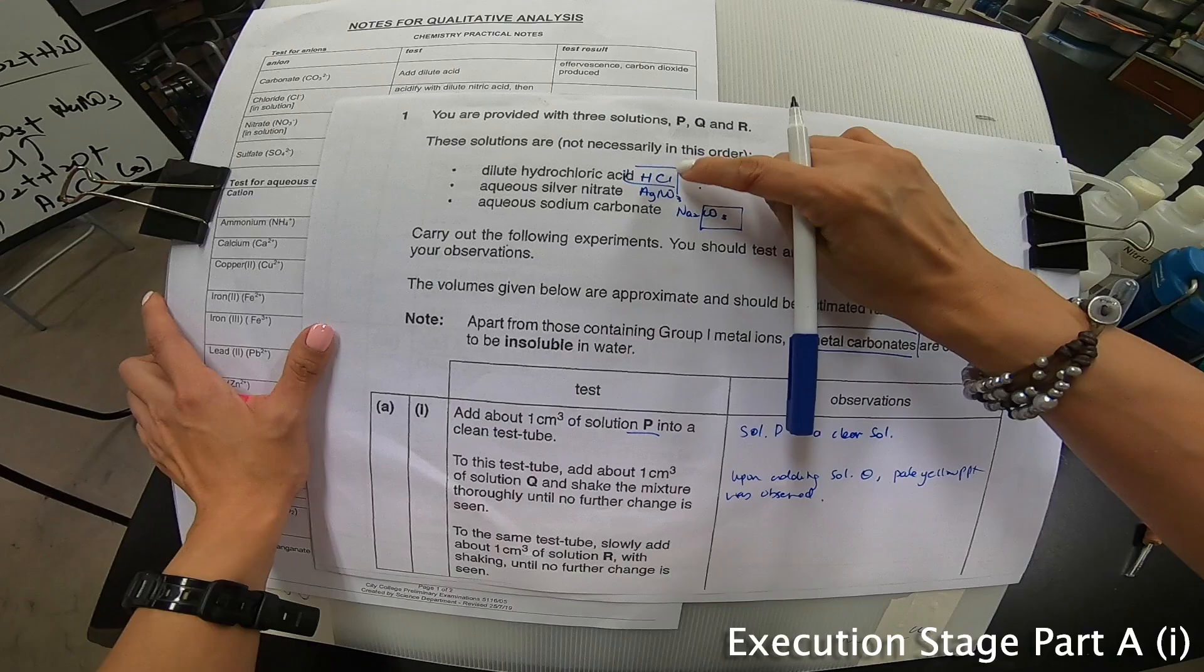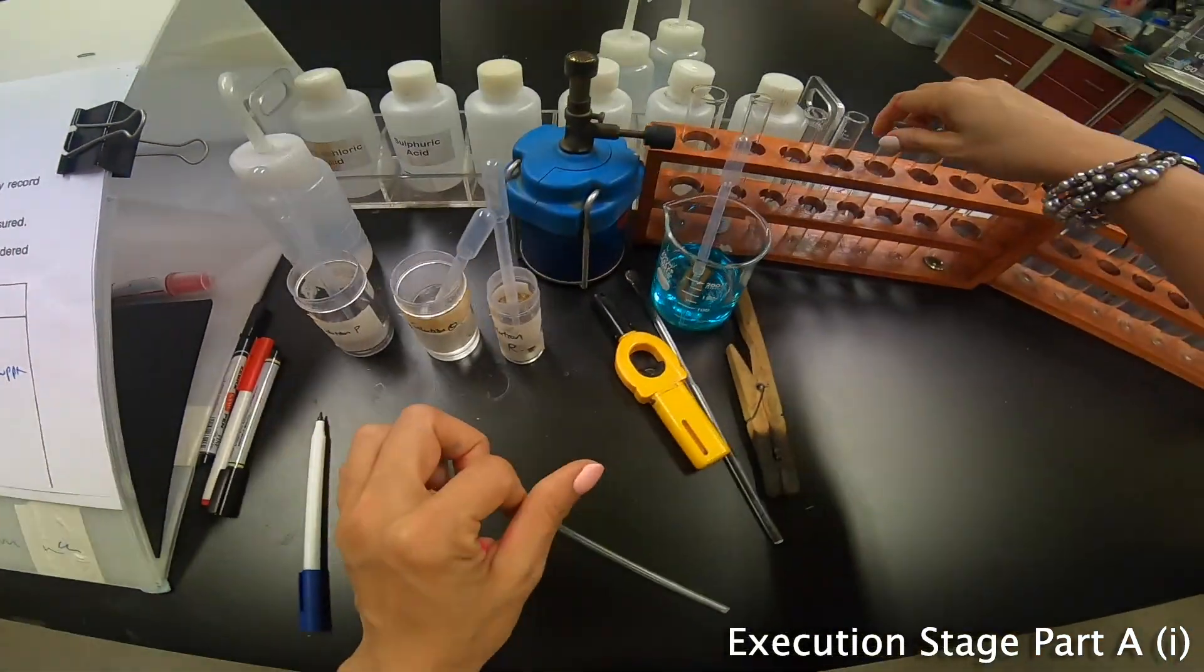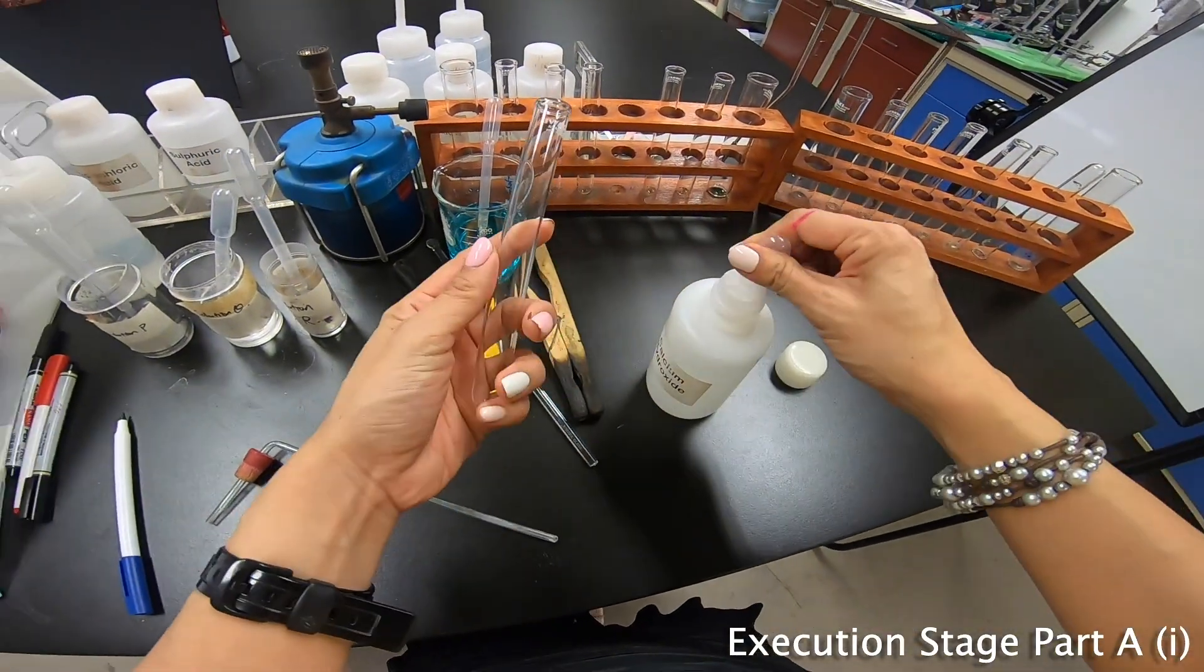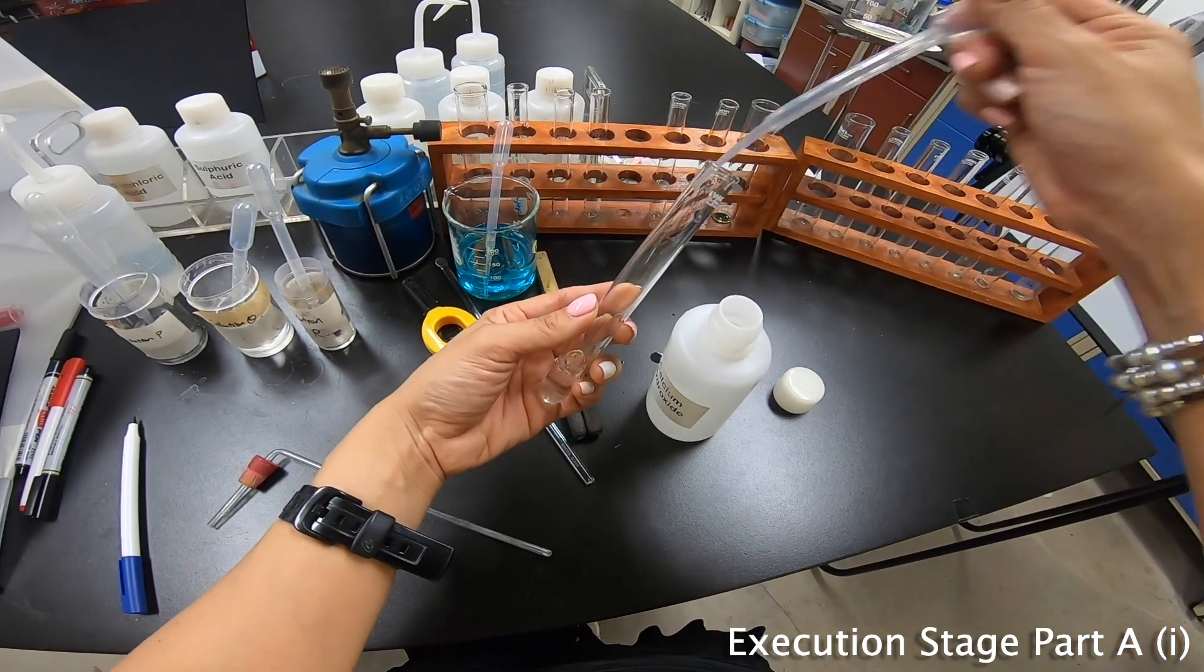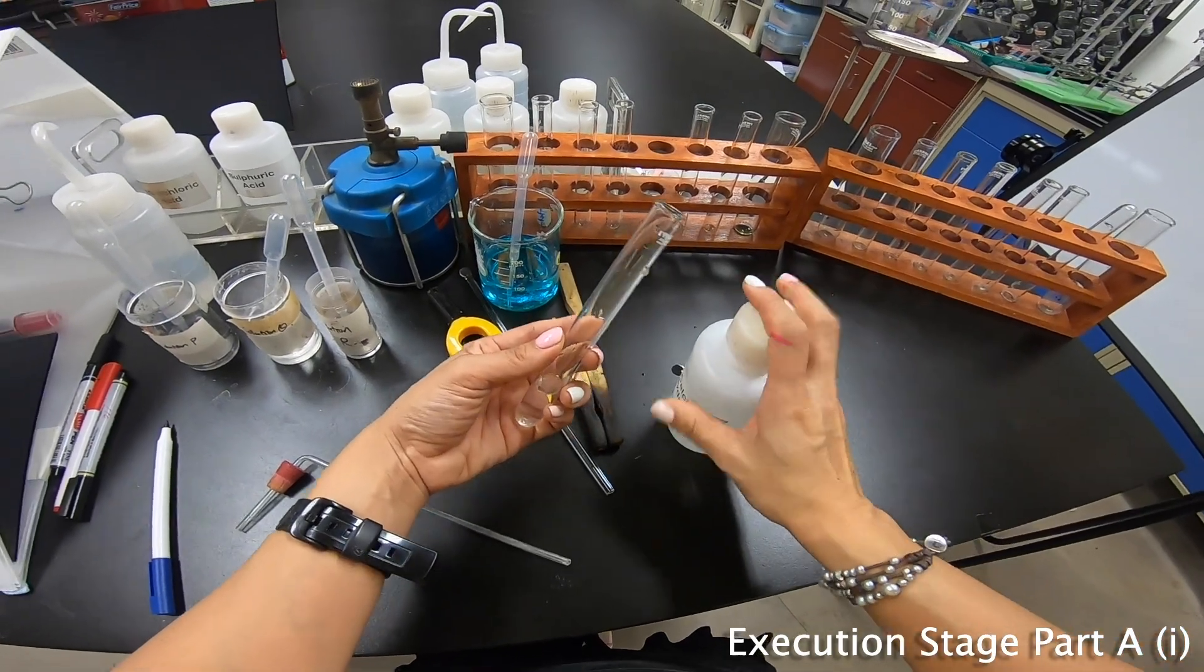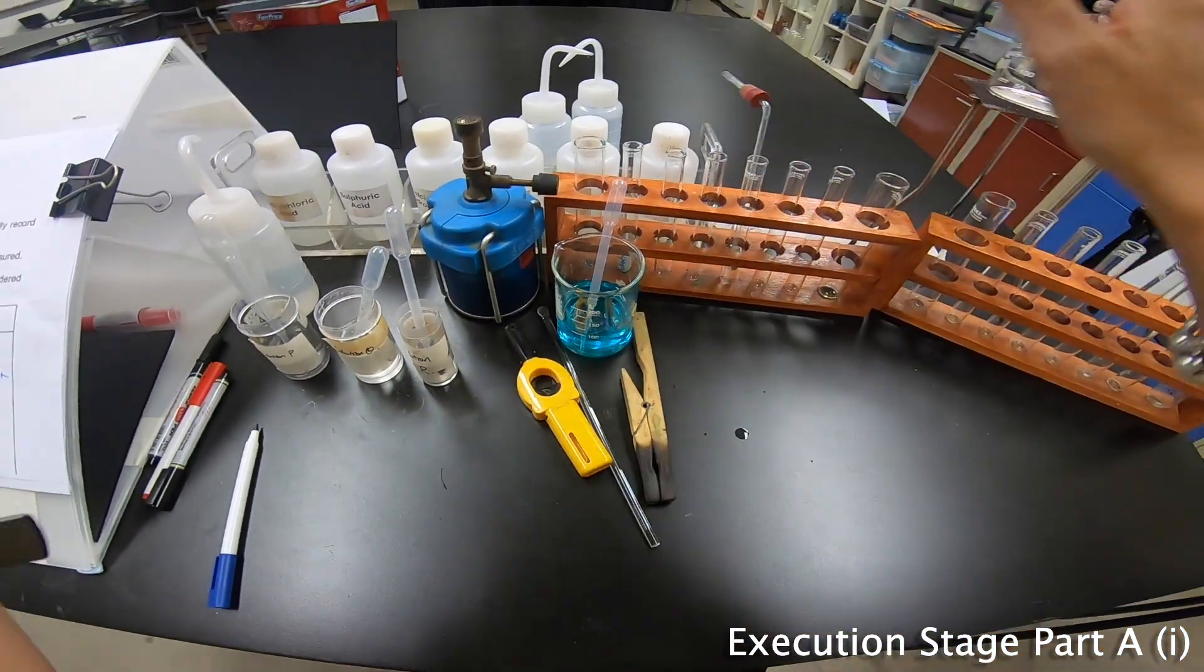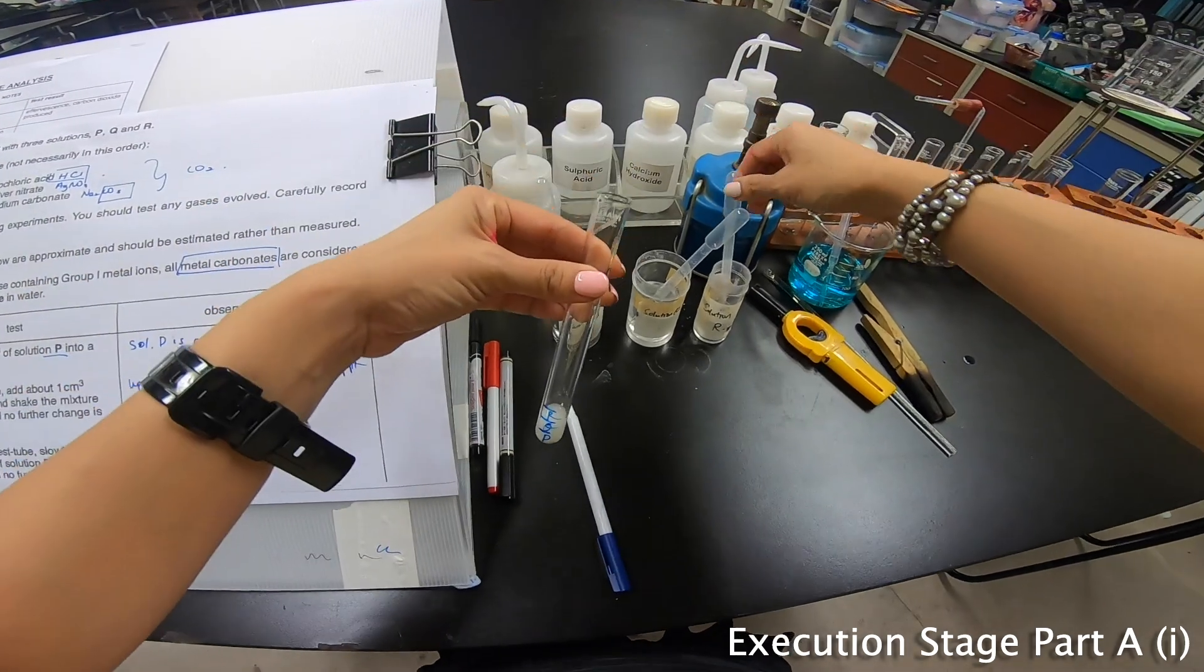Upon adding solution Q, a pale yellow PPT was observed. Now, before I add R, I want to pause for a while. Because I notice here that one of them contain carbonate and one of them contain acid. So whenever acid is added to a carbonate, CO2 is produced. I should have prepared lime water, but it's not too late now. I discover it. So let's quickly prepare our lime water. Prepare it beforehand. Put it at the side. And then, let me put the long tube inside here. Put it at the side here, just in case I see any effervescence, I know what to do.